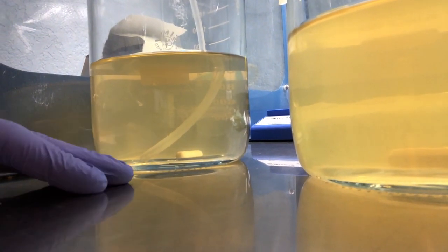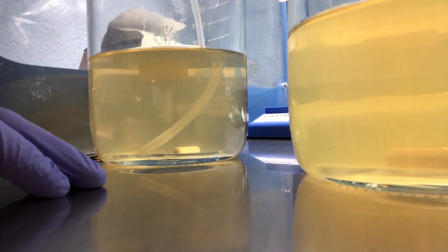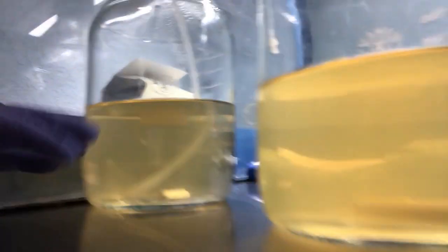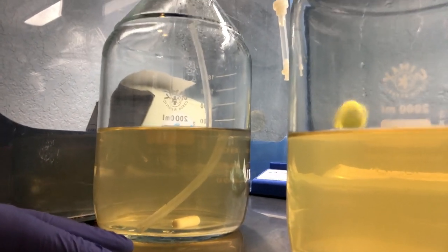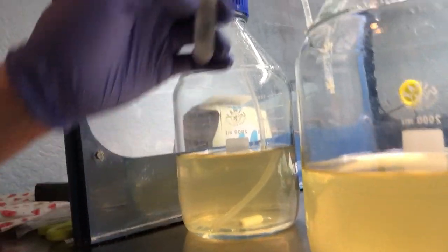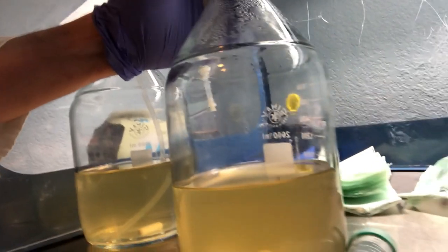Some of the other broths out there have chunks, or people like to add sawdust, which kind of hides any potential contamination. So the better the honey, the clearer the solution. And it will remain like this for months and months as long as it's sterile. But since these morels are going to be going outside anyway, I'm just going to dump these into here and then show you guys how I incubate my liquid cultures.